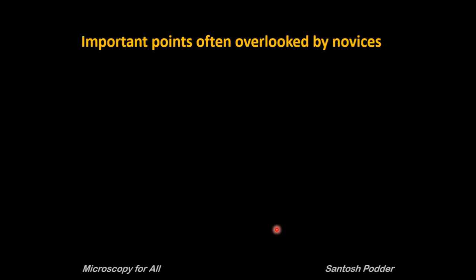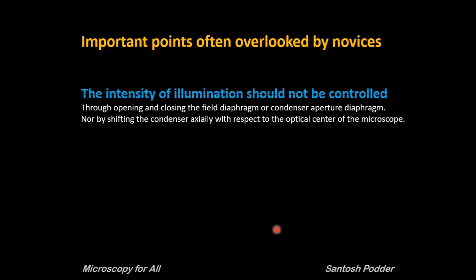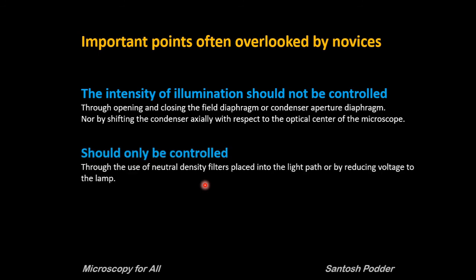Now, important points often overlooked by novices: the intensity of the illumination should not be controlled by opening and closing the field diaphragm or the condenser aperture diaphragm, and not by shifting the condenser axially with respect to the optical center of the microscope — I have seen many people have this misconception. Intensity should only be controlled either by using neutral density filters placed into the light path or by reducing the voltage to the lamp.